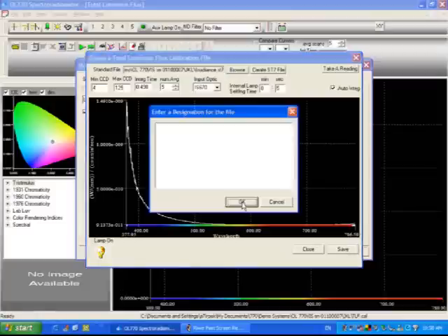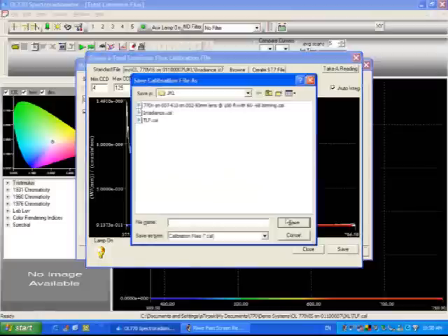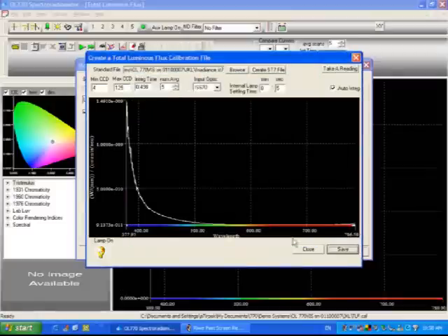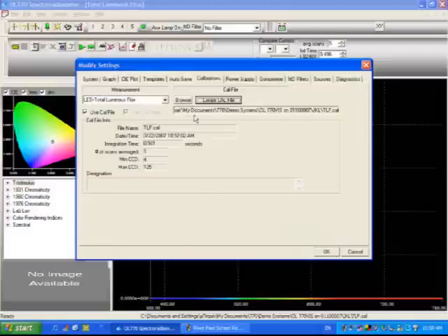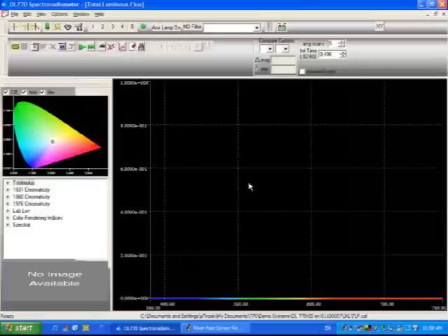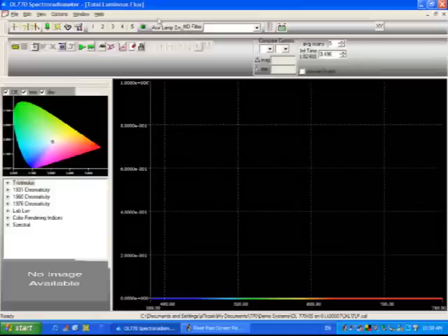Now we click save, and we'll save that file as tlf, and we'll exit out of here, and we'll make sure that we have our calibration file loaded, which we do, and we'll click OK, and I'm going to leave the internal reference lamp on at this time.